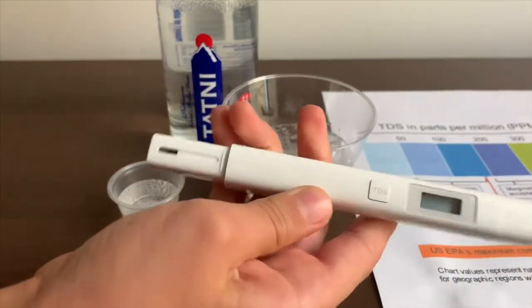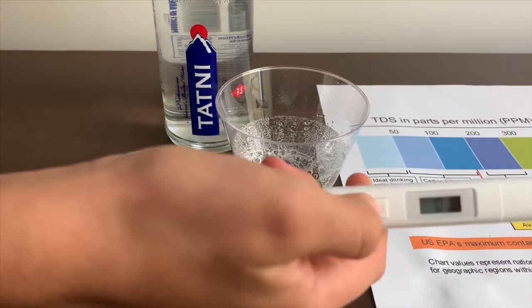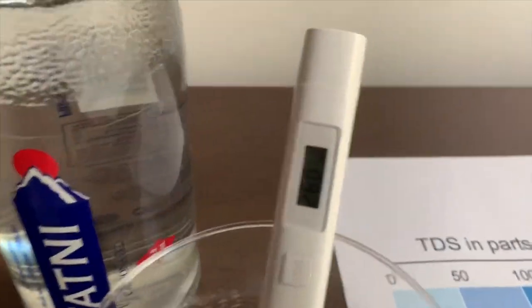This is our TDS tester. The link is down below if you want to buy it. Turn on the TDS tester and make sure it says 0. Let's put it in and let's wait.